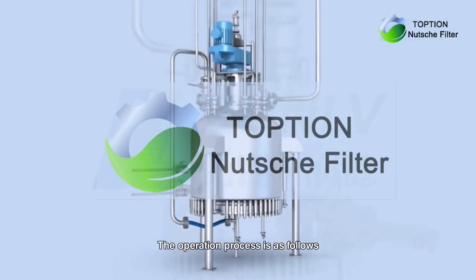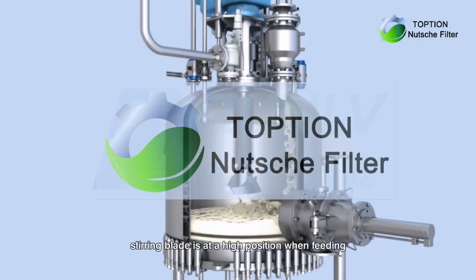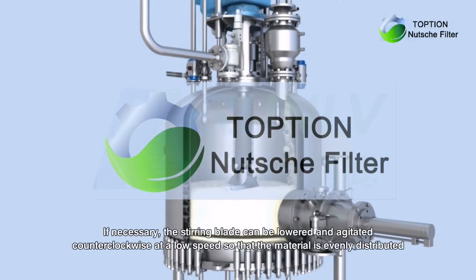The operation process is as follows. Feeding: open the feed valve for feeding. The stirring blade is at a high position when feeding. If necessary, the stirring blade can be lowered and agitated counterclockwise at a low speed.